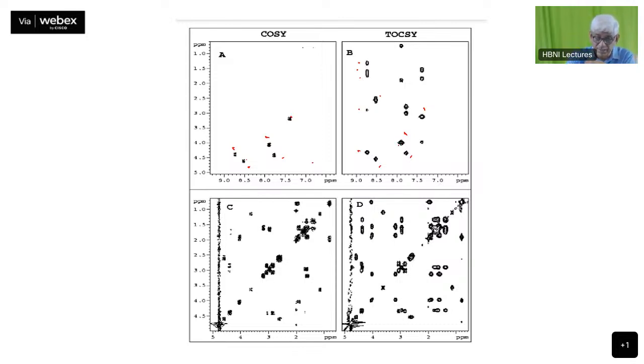Now, if you look at this one there, this has 2 fellows here, 1 here and 1 there. And this typically goes, this is in the area which is beta, and this goes to the kind of a methyl area. So typically by chemical shifts, you can guess this may be a kind of a residue which contains the beta and the gamma, so like a valine or something like that. So you have the betas here and the gammas there. Or it can be alanine. Alanine can also, but it will have only 1 peak. Alanine will have only 1, it will not have 2, because this is CH3. CH and then alpha proton and then the CH3. So it cannot be that.